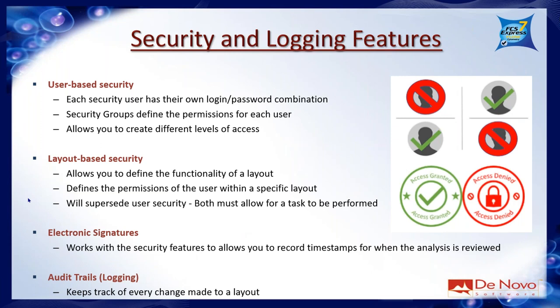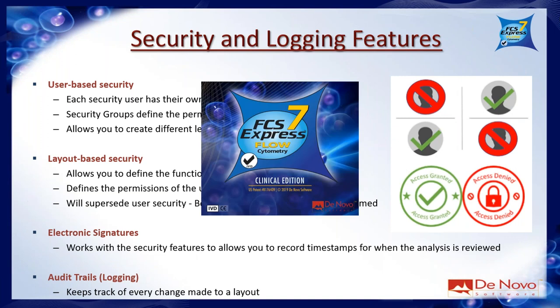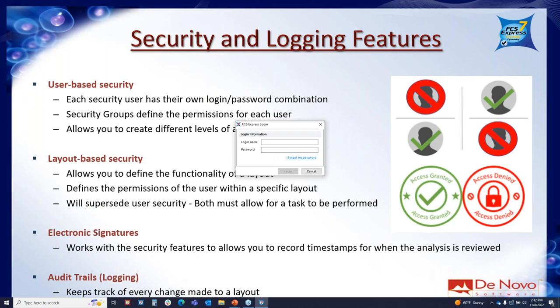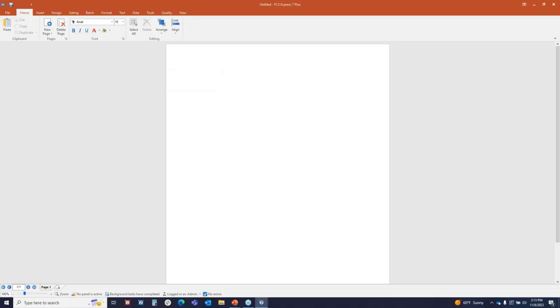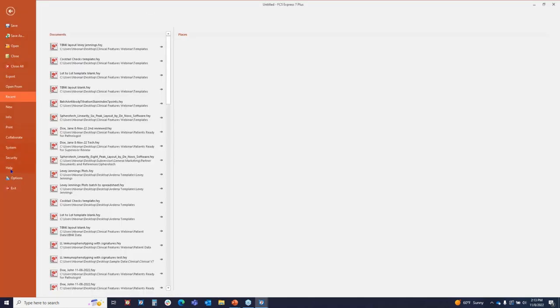Let's go into the software and see what this looks like in practice. I'm going to launch FCS Express 7 IVD. Since I'm using security and logging with this license, the first thing that pops up is a login screen. I'm going to log in as the admin. Every license that comes with security will have at least one administrator with permissions to do all of the things you might want to do. I'll start with a blank layout and navigate to File > Security to see the security settings.